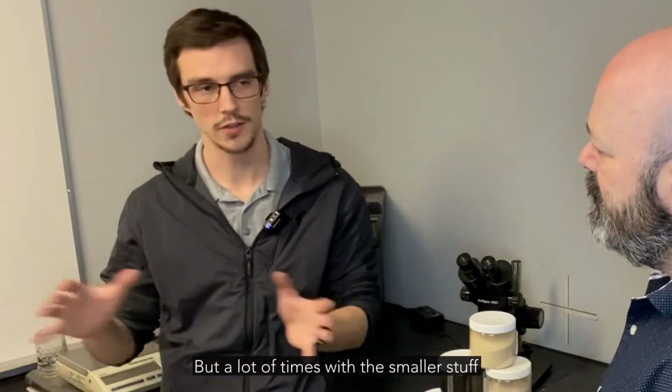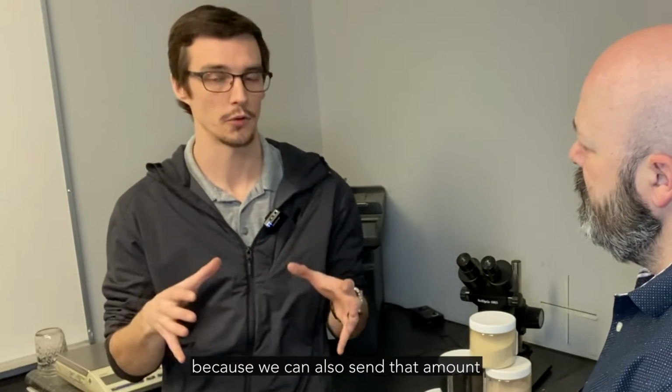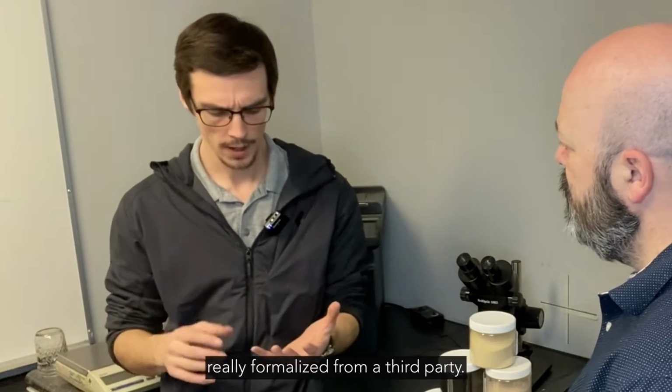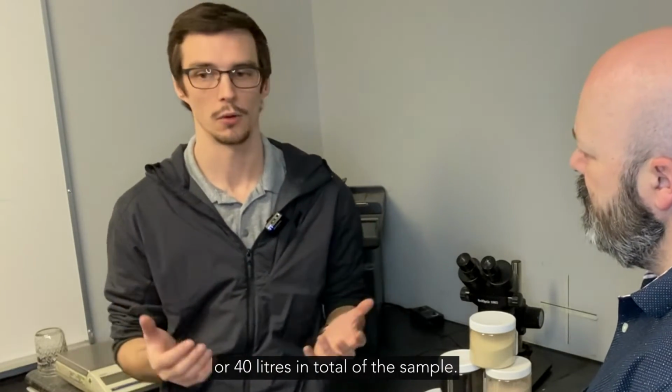But a lot of times with the smaller stuff we do here, we can do a smaller sample, about a gallon is what we often ask for, and that covers us because we can also send that amount for shear cell testing, and that's to get something really formalized from a third party. But if we're doing our normal set of tests, we generally would ask for 2 5-gallon pails or 40 liters in total of the sample.